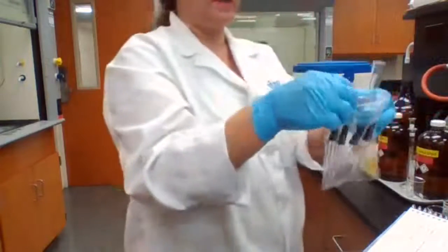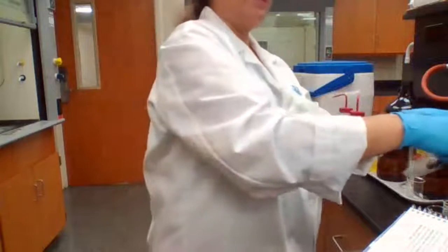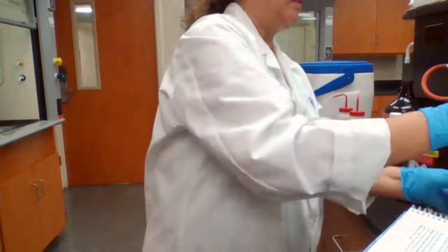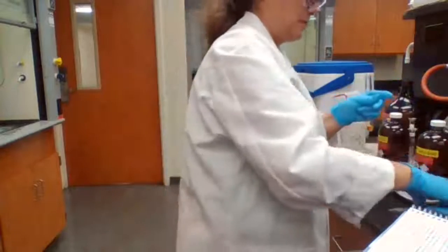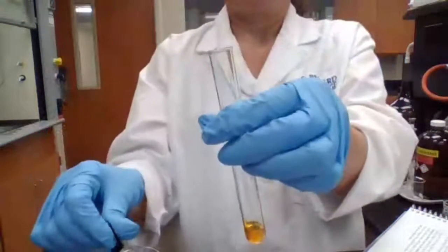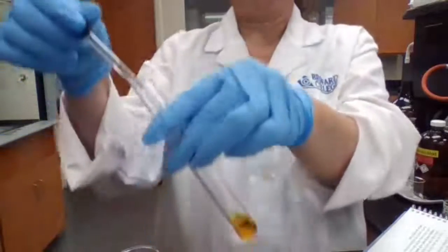So 1 molar sodium hydroxide. We're adding sodium hydroxide to the solution.